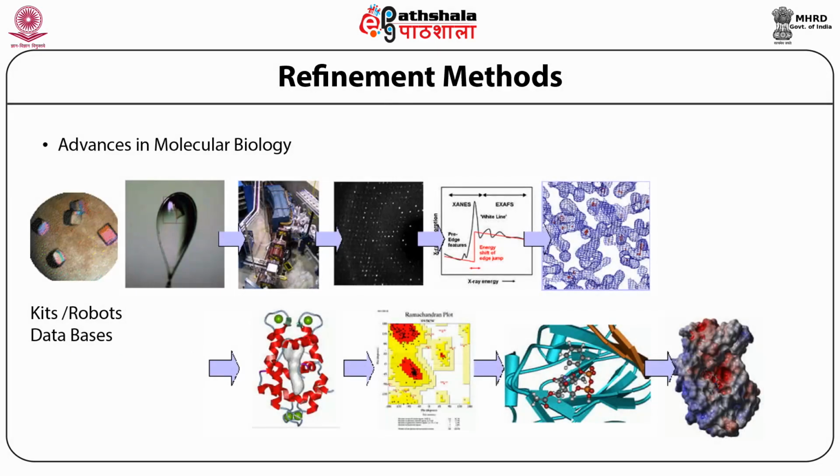So in brief, as discussed before, with advances in molecular biology and structural biology, different techniques, and robotics, structure determination using crystallography has become much easier. Now we have several robots and commercial crystallization kits, which allow us to screen hundreds of crystallization conditions very fast, using robots and imaging techniques to see the drops regularly.